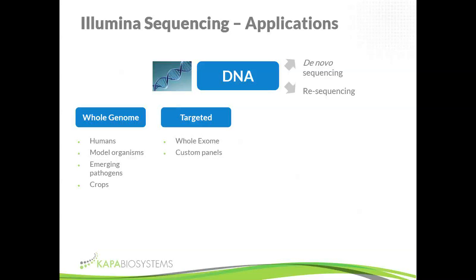Then there's a category which I just call specialist sequencing. These are technologies or techniques that help us look at very specific things. For instance, ChIP-seq is a sequencing methodology that helps us look at DNA-protein interactions. We can look at epigenomics or study epigenomics. A technique called methyl-seq allows us to look at DNA that's specifically methylated in genomes.